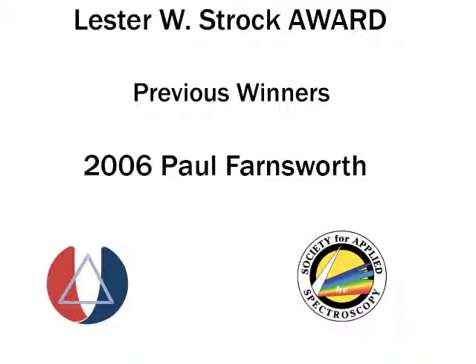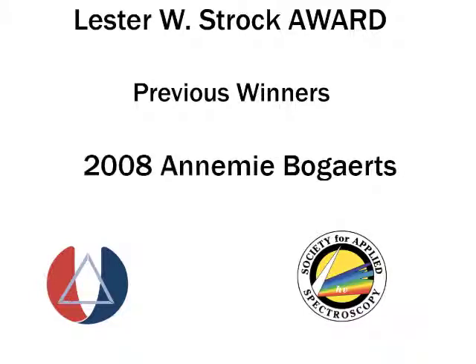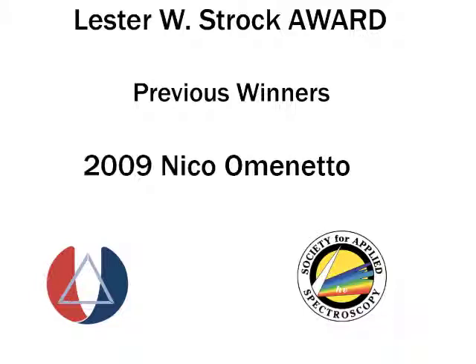So I think I'd summarize in saying to you that I wouldn't want to predict the future more than anyone else would, but I could say that sample introduction is probably not the Achilles heel of atomic spectroscopy, because we have a very powerful array of different instrumentation for elemental analysis that has sufficient detection power to meet most of the needs for analysis at this time. But I think when you really look at it, we're roadblocked from a number of other avenues, and that is sample preparation itself and contamination control.